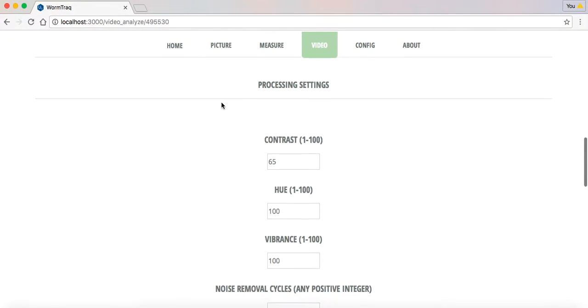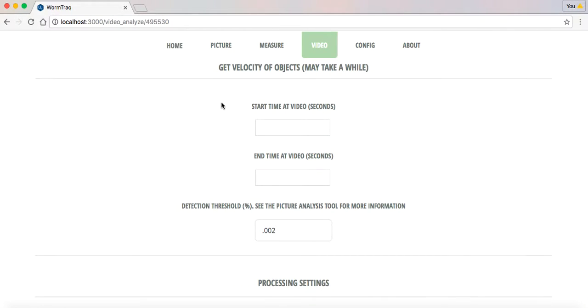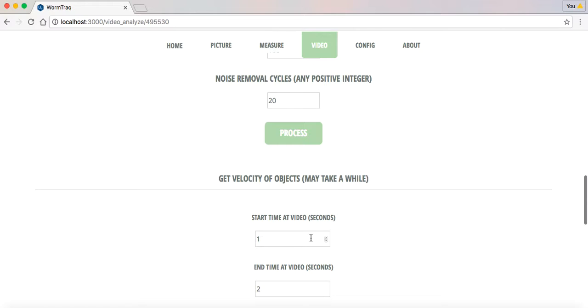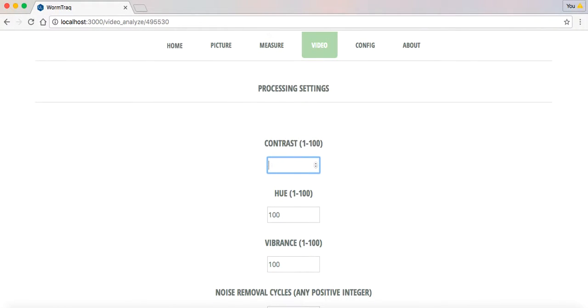But what you're probably more interested in is going to be a basic velocity. Now, this is about as basic as it gets. It's going to take essentially the positions of the worms in various time frames, and then say, okay, over some time period, really the definition of velocity. Let me enter some time frame, and I'll explain to you some of the caveats and what goes on here. So we're going to enter this, and for this image, it's interesting.